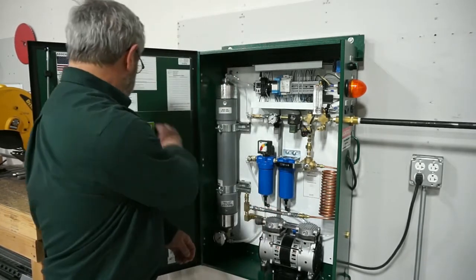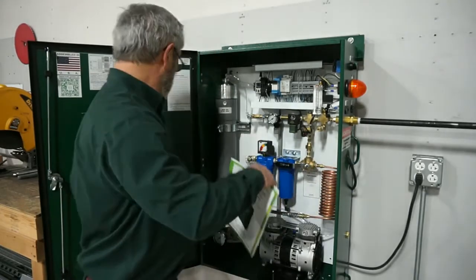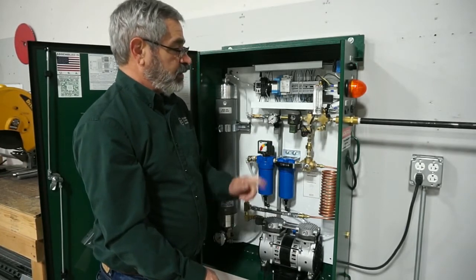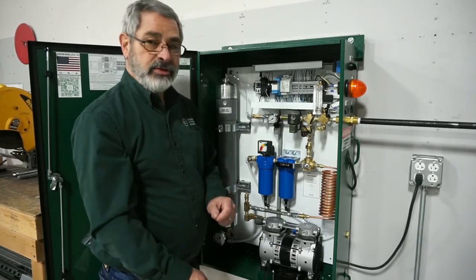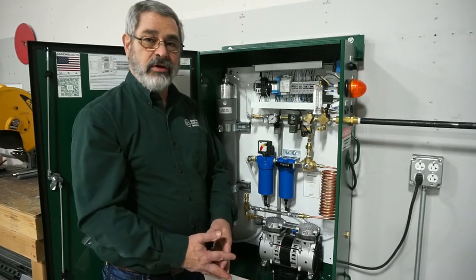There is a step-by-step process on how to replace this that's in the installation manual that comes with each one of the units. Once you've completed the filter replacement, the next step is to turn on the nitrogen generator. Verify that the production rate and the purity is as it was originally from the factory, and you're ready to go for another year.